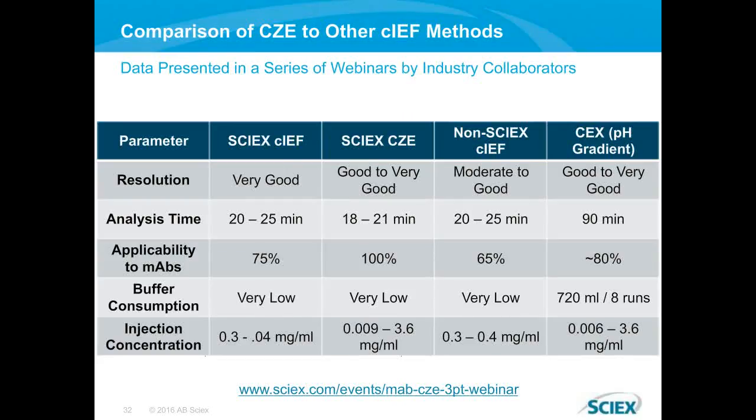Just a quick comparison on CZE versus CIEF. This was actually done by some of our industry collaborators in a series of webinars that I invite you all to go back and watch. The link is down there at the bottom. They basically looked at all of the different ways that you can do charge heterogeneity, and they ranked them and wrote down some notes here.